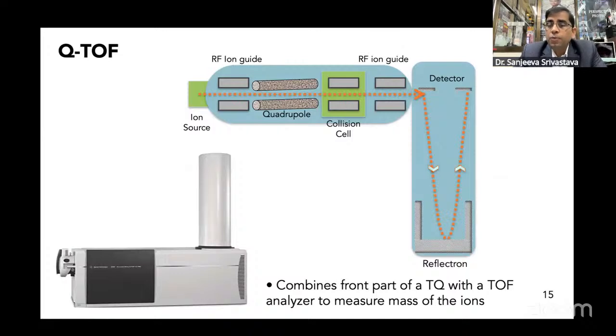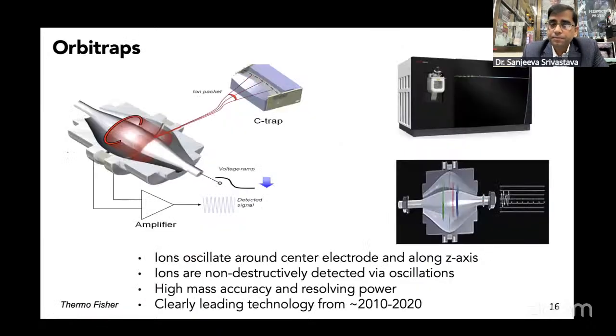It is one of the very popular configurations of mass spectrometer, where you are utilizing 2 principles, quadrupole and time of flight. In the quadrupole, you have the metallic rods where the ions move in the magnetic and electric field, followed by travel in the time of flight path, where they get further separated, and therefore you have the QTOF, right? I hope you are clear. We have ESI, electrospray ionization, as the ionization source, followed by the QTOF, 2 different mass analyzers, which is tandem mass spec, and therefore we got the ESI QTOF as one of the configurations of the mass spec.